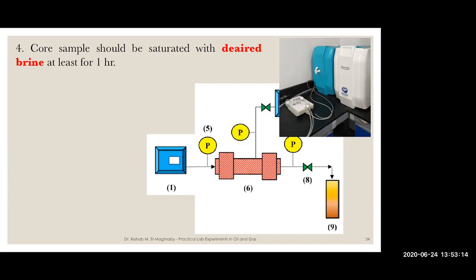Okay. So why deaerate it? Because normally, water contains dissolved air inside. And if you inject brine without any deaeration, the air will separate and cause a small air pocket inside the core, which will affect your permeability measurement. This is possible, and this can happen.